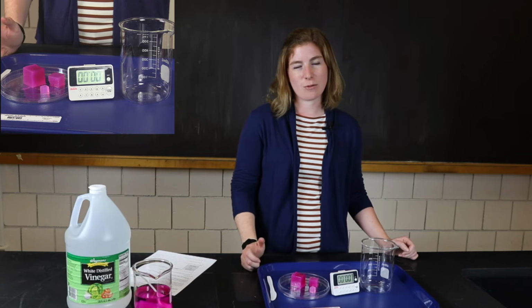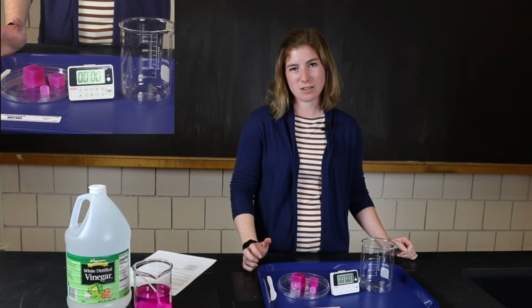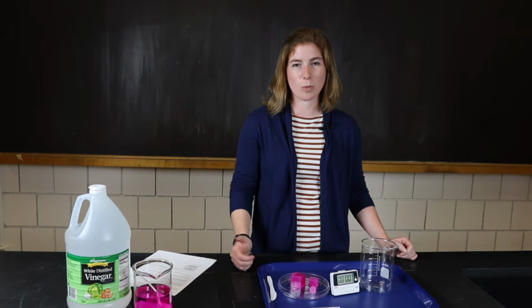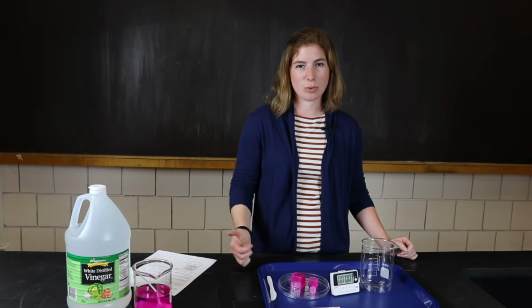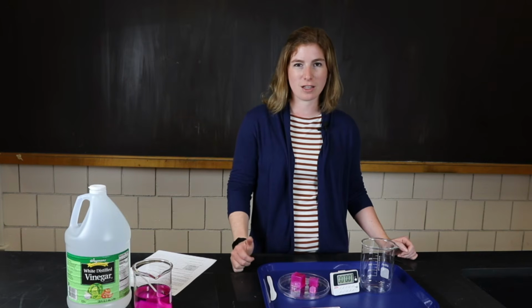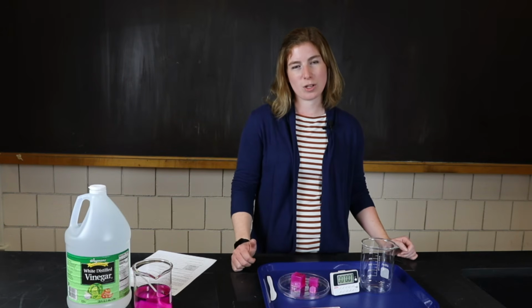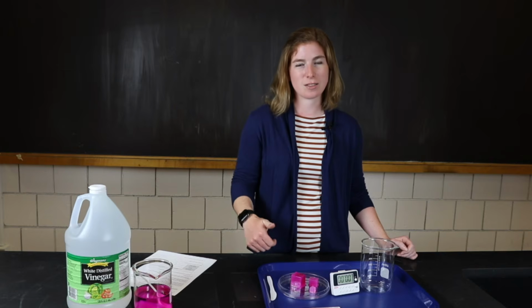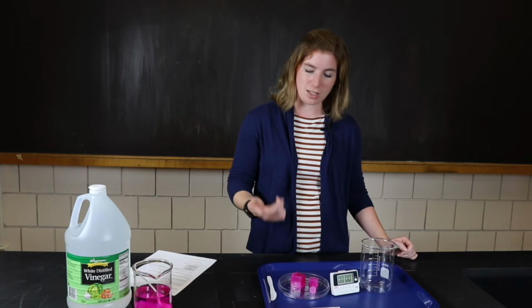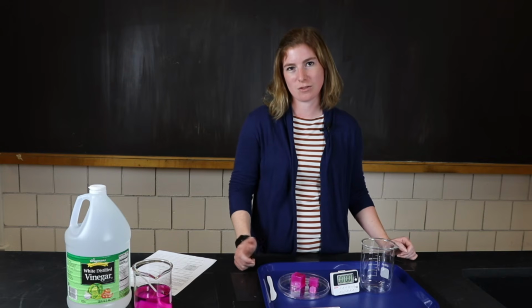Before we get started, I want you to take a look at your pre-lab questions. Probably go ahead and read your introductory information first too. It'll have some important information. And then do your pre-lab questions, which will require you to do a little bit of math. You might want to pull out a calculator. And when you're done with your pre-lab questions, make sure you come back because we're going to get started on the procedure. And you guys will get to see what happens when we put these cubes into the vinegar.